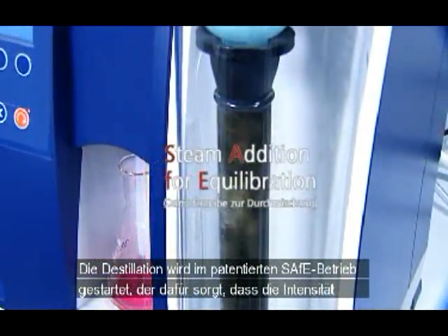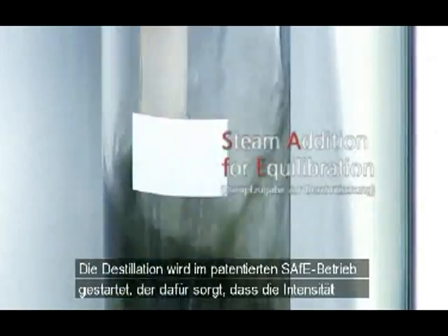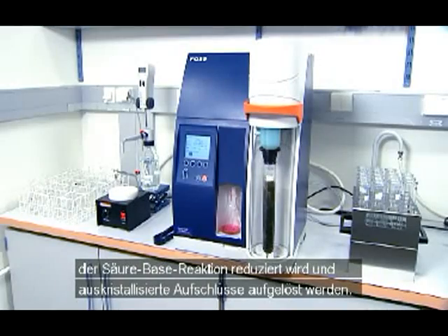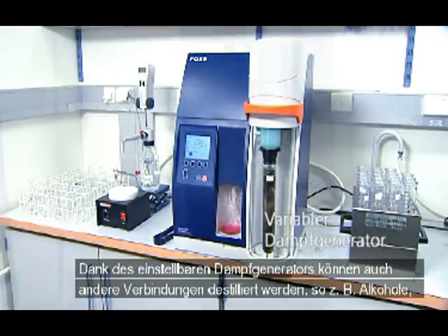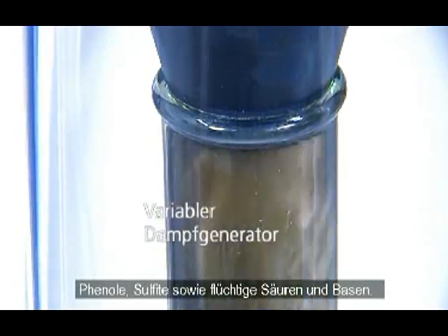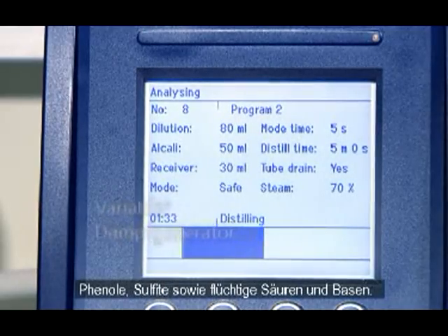Distillation starts with a patented safe mode which reduces the intensity of the acid-base reaction and helps dissolve salt cakes formed after digestion. The adjustable steam generator enables the distillation of other substances such as alcohols, phenols, sulfites and volatile acids and bases.